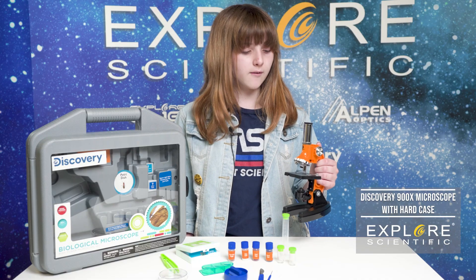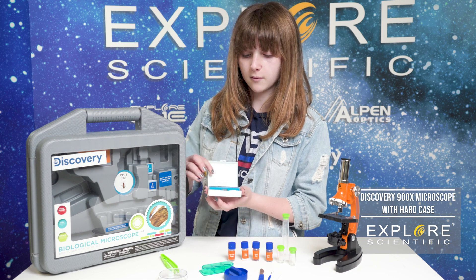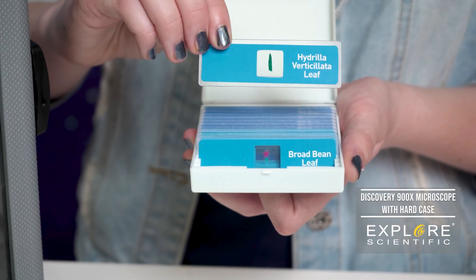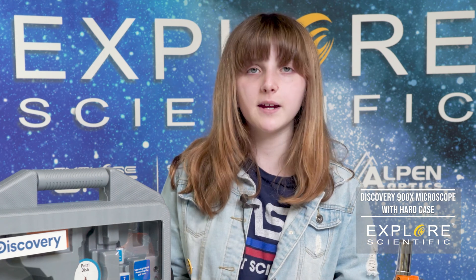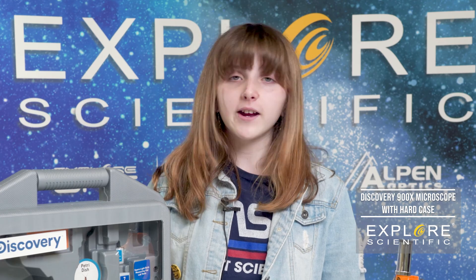In this kit, you'll have everything you need to do your own explorations, including the blank and prepared slides that are really cool. There are blank ones and some that are already prepared with different specimens in them. If I were to explore this kit, I would probably explore pollen, because right now it's spring and it's allergy season, and allergies are very annoying.